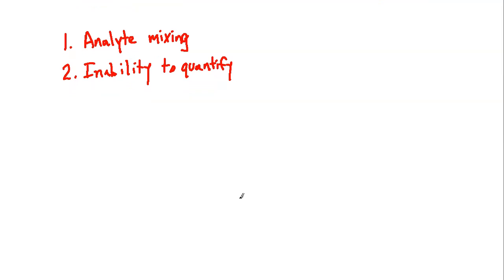So when band broadening occurs, it is important to keep in mind, because we're going to start talking about these issues here. Band broadening will occur naturally as a column ages. So your stationary phase, your column, the more runs you put through it, and certainly the harsher the conditions for those runs, or the longer the runs take, you are going to wear the column down.